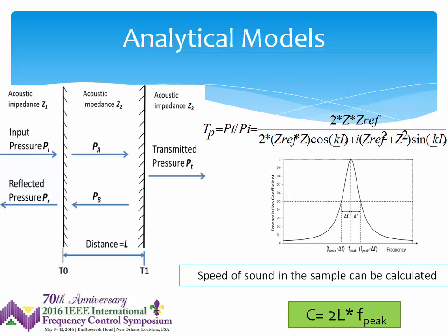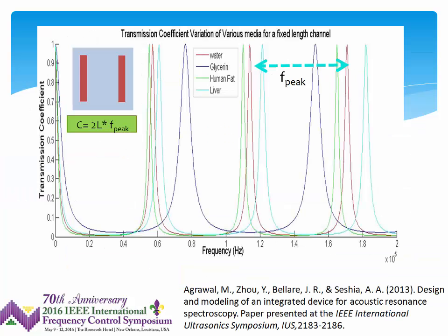And at a characteristic set of frequencies, you of course will set up cavity resonances in the sample, depending on the material being probed. You'd see different finesse factors associated with those resonances.